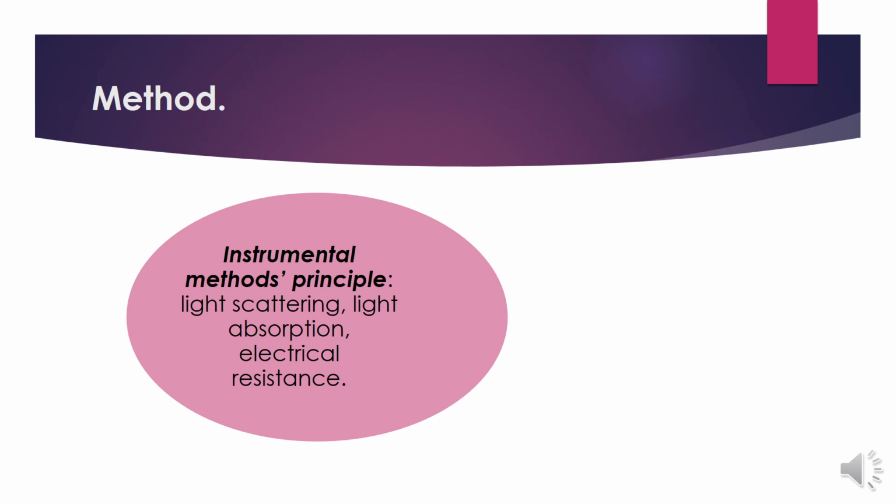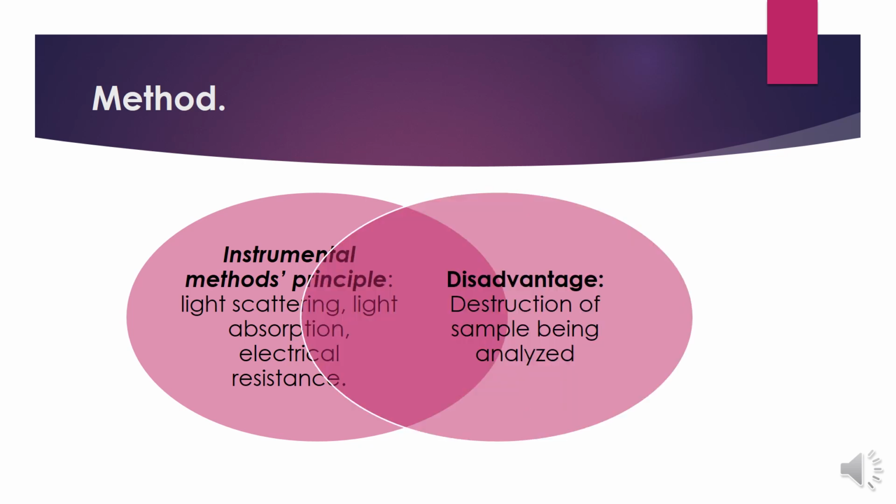So wherever instrumental or equipment methods are applied, their disadvantage is the destruction of the sample, with the exception of video image projection. Any analytical instrument applied for confirmation requires you to prepare a sample, and there are also more chances of product destruction when the instruments are used for the analysis of the sample.